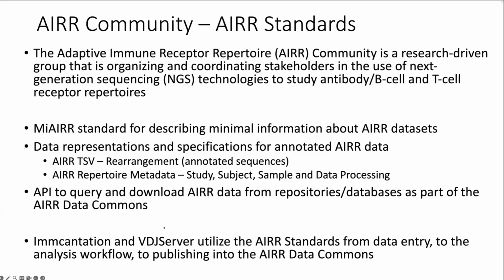And so Immcantation is a critical part of all that. A lot of the data in the AIRR Data Commons has been processed in a standard way using some of these Immcantation tools. And I think that's really good. I say here, it kind of flows through all of it, from the data entry all the way to where you publish your studies there.